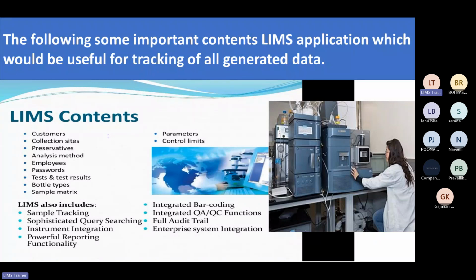Who are involved in or related to the software? Who is going to work with the software? Who is going to benefit from the software? All these things will be explained.